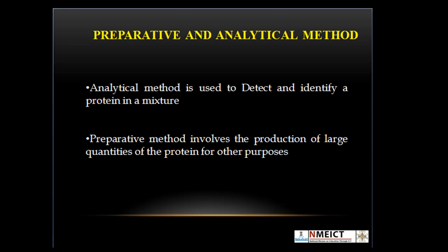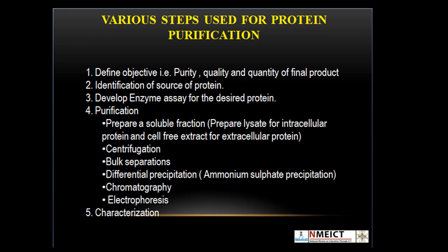There are various steps used for protein purification. We need to define the objective, identify the source of protein, develop an enzyme assay, and then proceed to the purification.